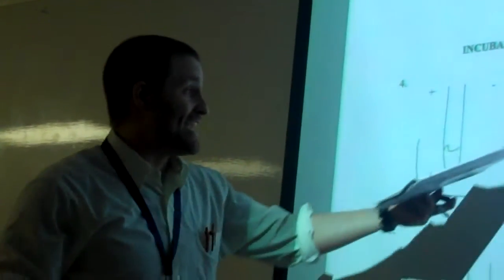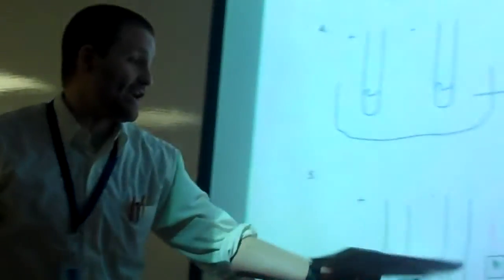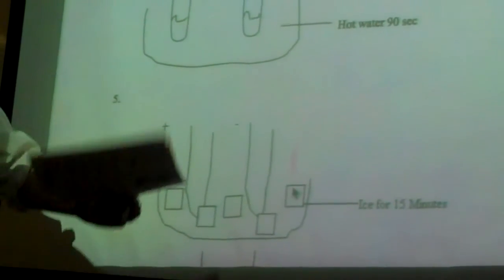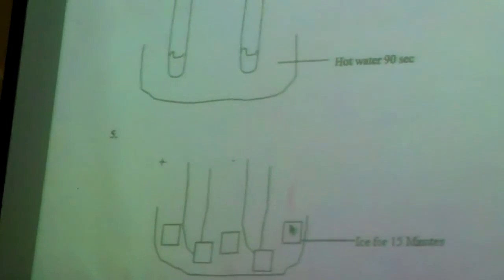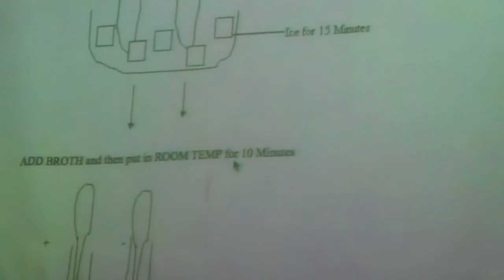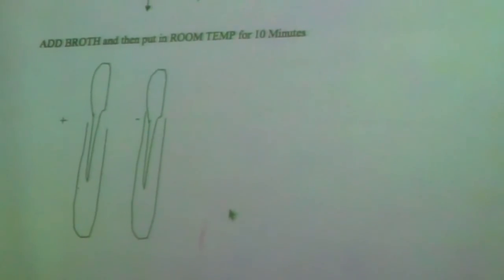As soon as we get done heating it, this is important, you immediately go from here to here and put it in ice cold water. So what's that going to do? Close it back up, shrink back up. Kinetic molecular theory that you'll learn later: how hot stuff is is how fast the molecules are moving. This is a broad overview, and this picture diagram is a much better explanation than what the kit it came with says.